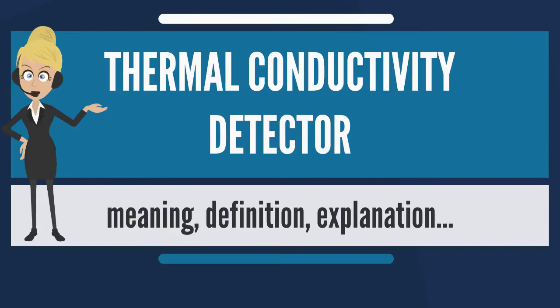Since all compounds, organic and inorganic, have a thermal conductivity different from helium, all compounds can be detected by this detector. The TCD is often called a universal detector because it responds to all compounds. Also, since the thermal conductivity of organic compounds are similar and very different from helium, a TCD will respond similarly to similar concentrations of analyte. Therefore, the TCD can be used without calibration and the concentration of a sample component can be estimated by the ratio of the analyte peak area to all components, peaks, in the sample.